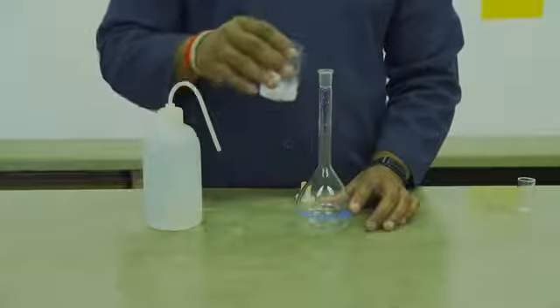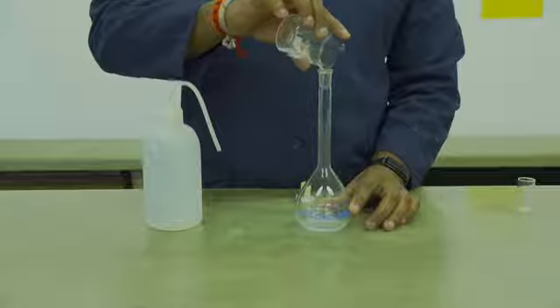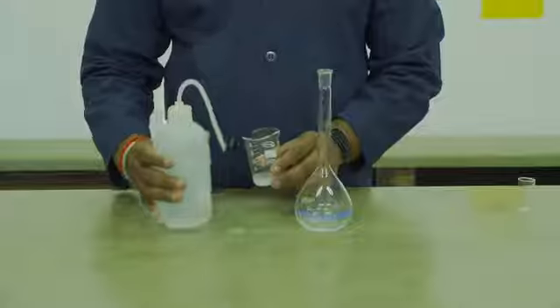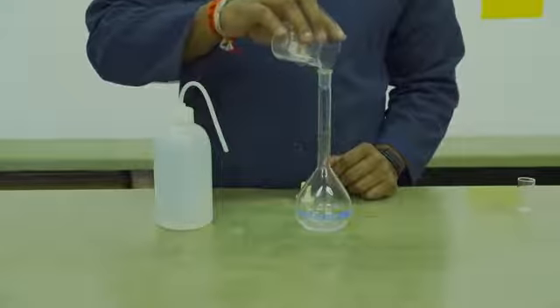Once the solid has dissolved, you are going to transfer it into a 250 ml volumetric flask. Ensure that you rinse out the beaker at least three times with deionized water and transfer it to the volumetric flask.